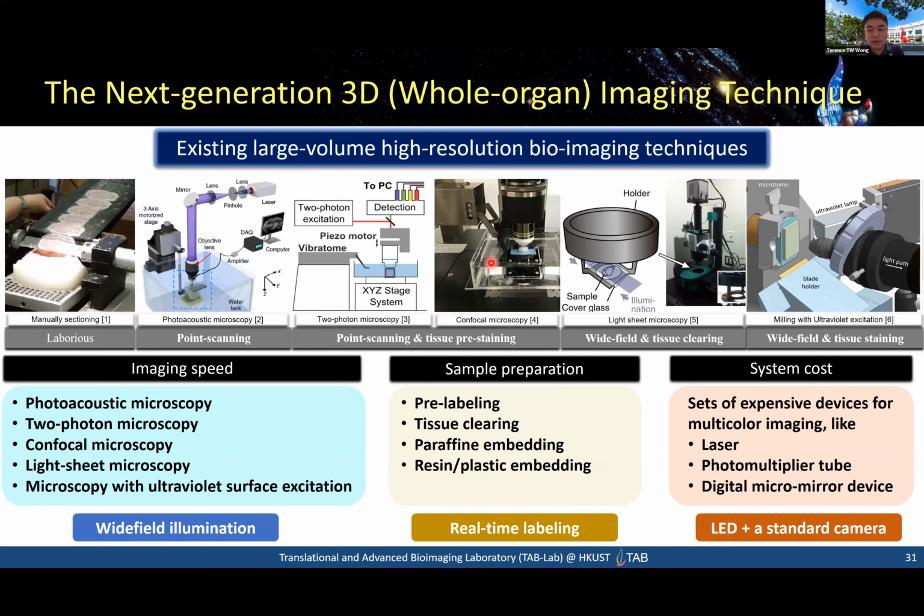Another domain is checking for metastasis, which is more on the medical research side, and may not be during operations where you want an immediate outcome, because it still takes some time. Although it is faster than many methods, it's still not to a point that you can get it in a second or with a click of a button. So I would say it's on the research side. Maybe transcriptomics is also a very hot field. You can serve a thick tissue image with H&E contrast and also borrow transcriptomic applications to project potential changes of genetic sequence. That is also a very hot field that we are trying to investigate.